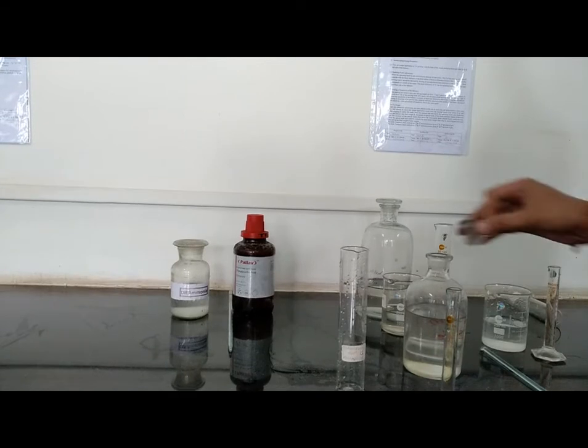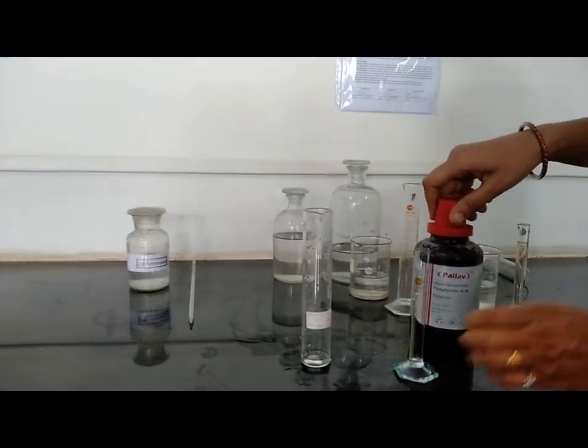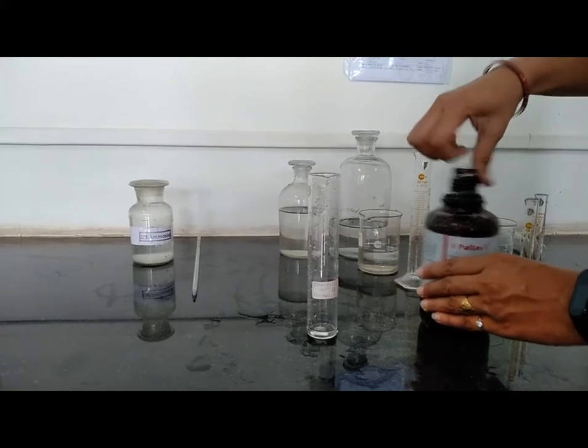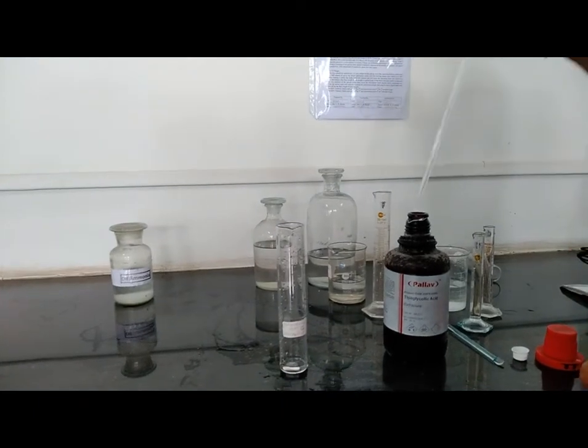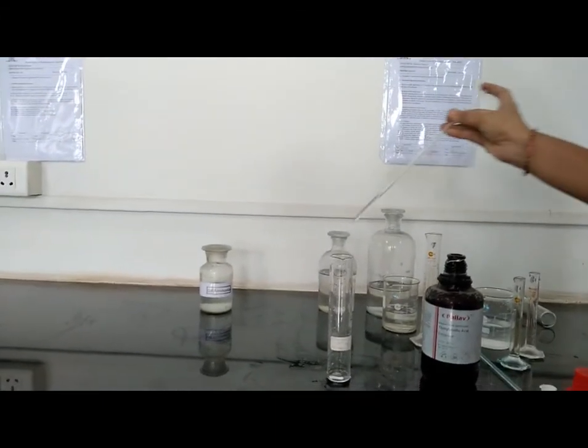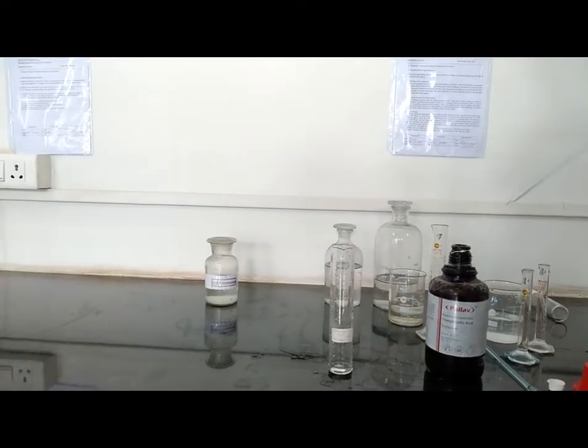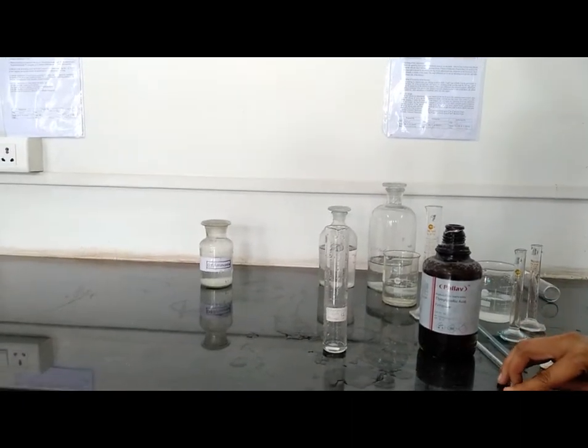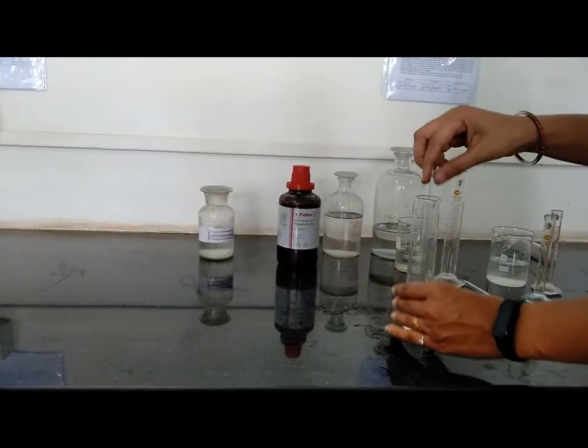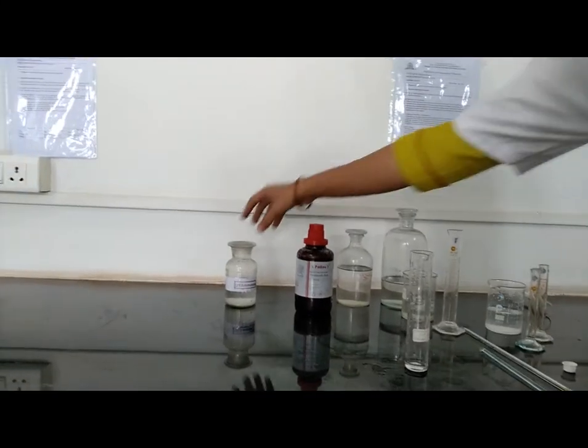Then add 0.1 ml of thioglycolic acid into Nessler cylinder. Mix it properly with the glass rod.